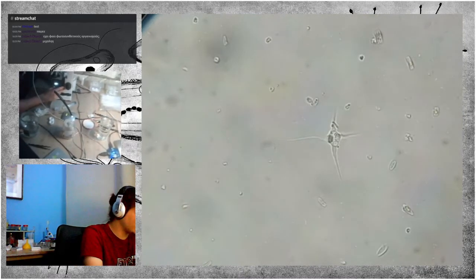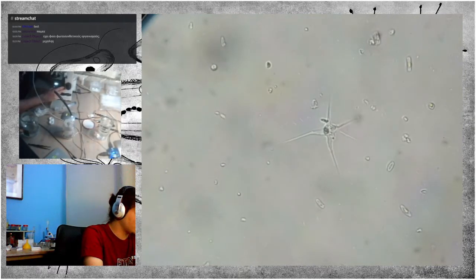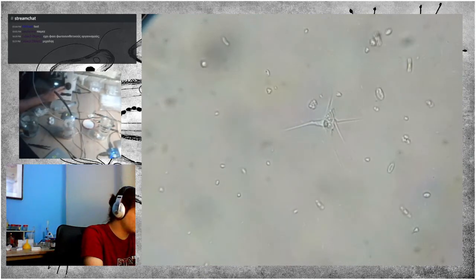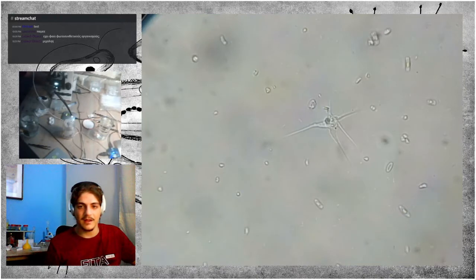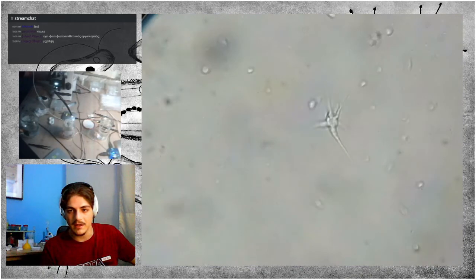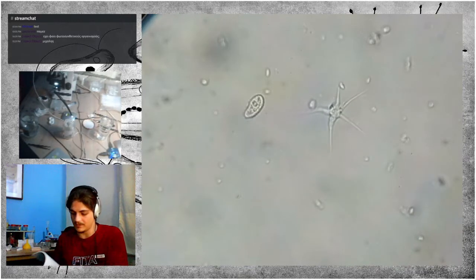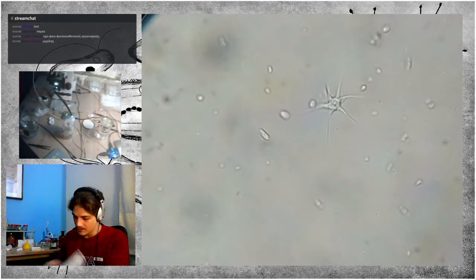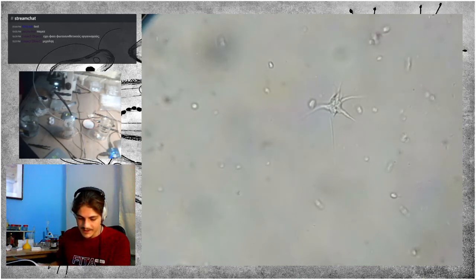This is another amoeba, and let me see, because I can remember correctly. The amoeba is the star-like, cross-like thing in the middle of the screen. You can see right now. But let me see, because I think there is an example of such an amoeba here in the book. Oh, it is.